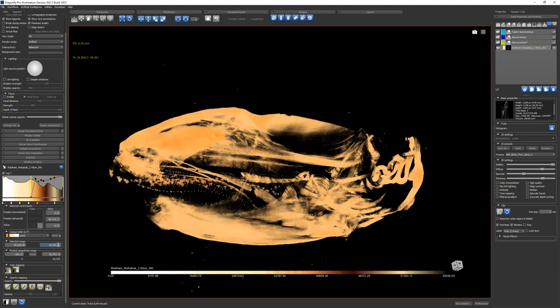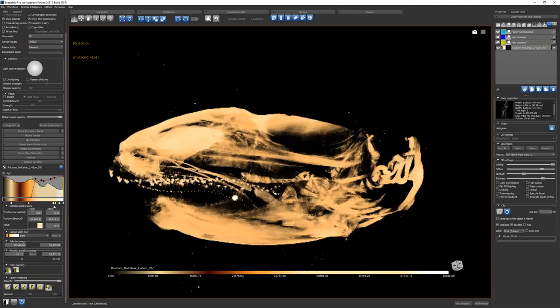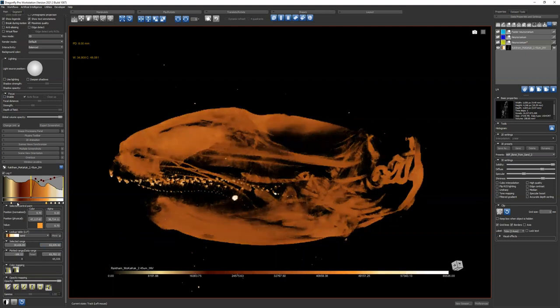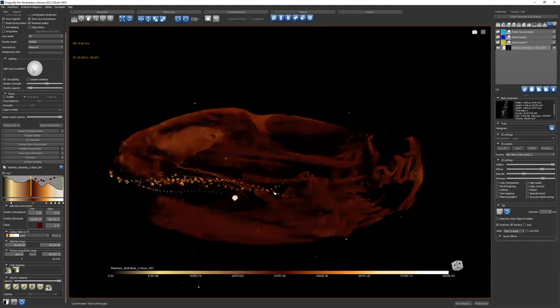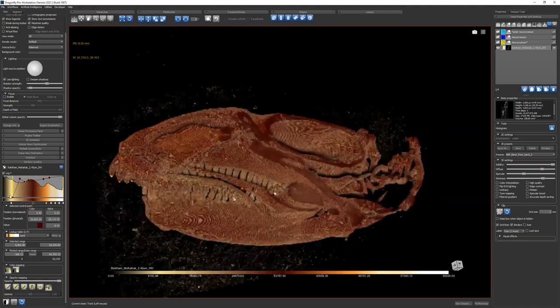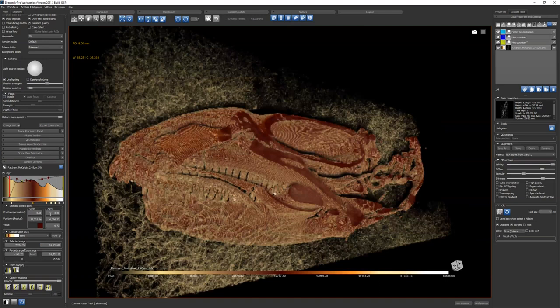If you want to take an image in 2D, you just do the same thing. Right, so you can just drag these across if you want to keep your color map, but you want to do it in a different density range. But you wouldn't really want to do that probably. Anyway. Yeah, reset.